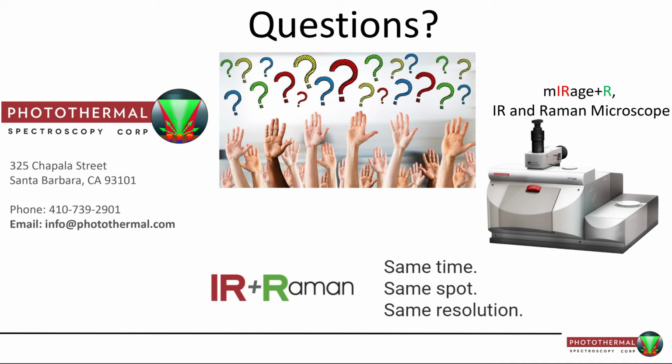The next question, spectral ranges, are other spectral ranges available? I'll answer that one as well. I think, Victoria, you used probably one of the earlier QCLs that was on that system in Soleil. I know they have since been upgraded to have a new QCL which has a wider spectral range, and really exciting, they also have access now to the CH stretching region, which is pretty novel for QCL.